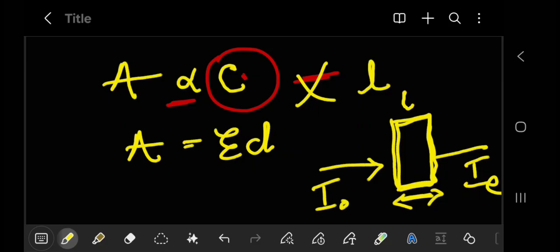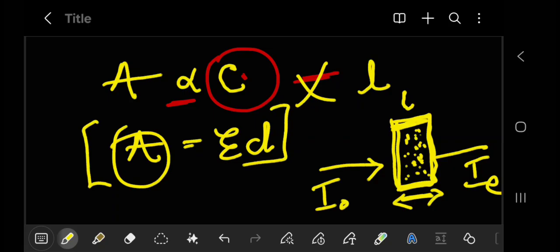So you see, the absorbance of this solution in this cuvette, because the cuvette is where you introduce the sample before you place it in the spectrophotometer, is directly proportional to the concentration. So the more the absorbing species, the more the absorbance. And it is also proportional to the distance the incident light is able to travel within the sample. So that is basically it. You should know the relationship very well.